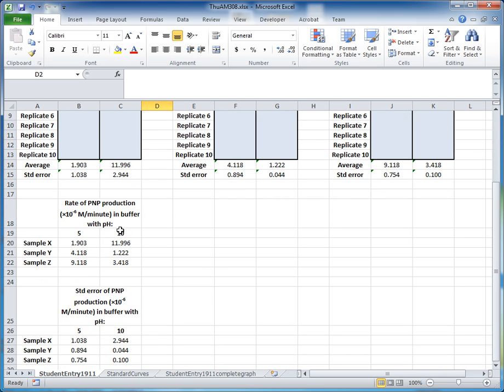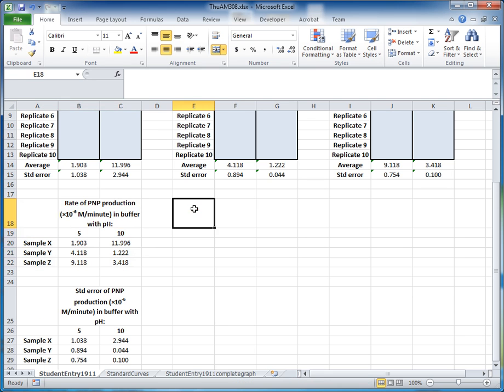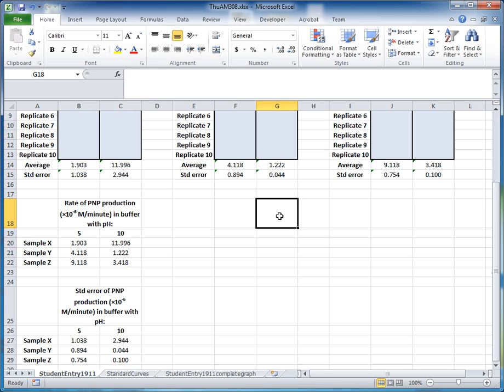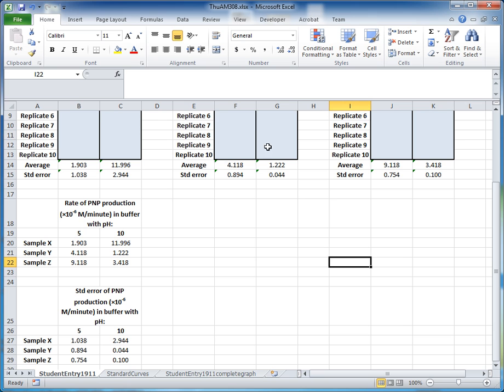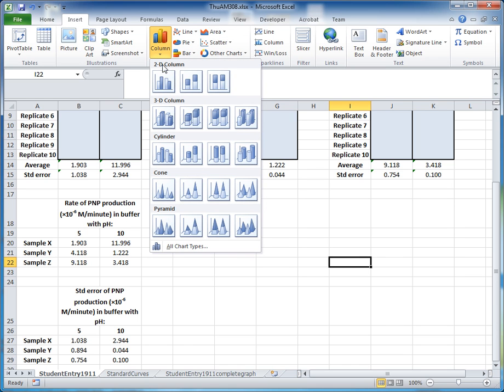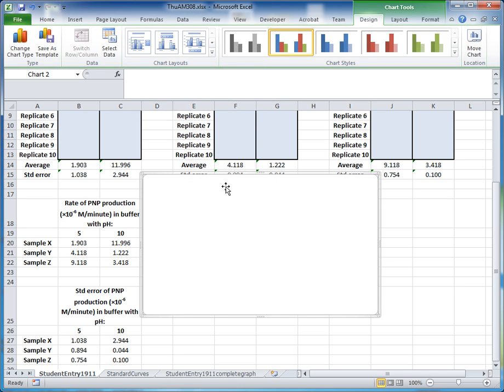Scrolling down, the spreadsheet already has these averages calculated. We want to insert a column graph representing these numbers. The best way to insert a graph in Excel with the most control over the data is to insert a blank graph. Click somewhere in the spreadsheet with no data, come up to the Insert tab, click the column icon, and select a simple 2D clustered column graph.